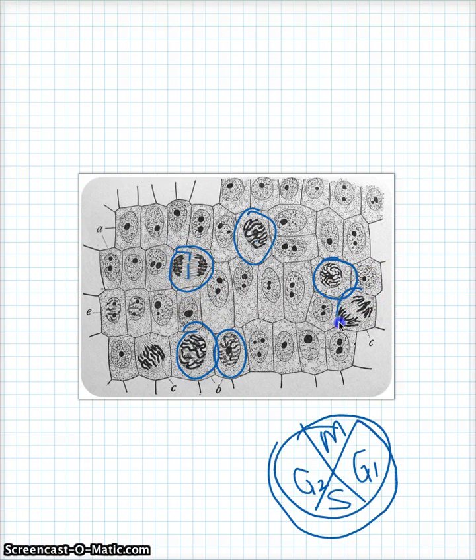Here's a really great anaphase picture. You know, this is metaphase. We already did that one. So, that's pretty much all of them that are in mitosis, except for these guys. What's going on here?